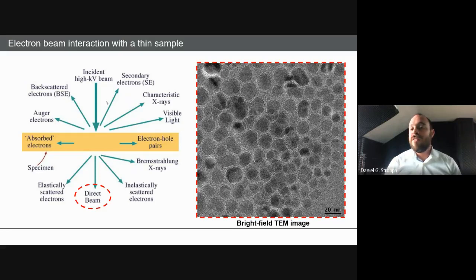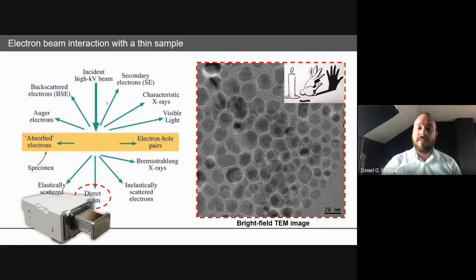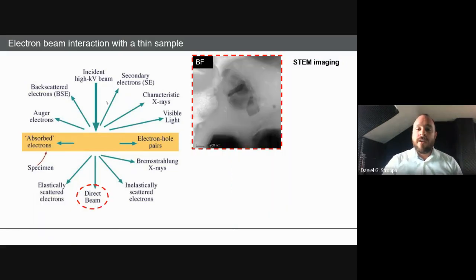And we can also collect different scattering ranges. And this is the core of STEM microscopy, that by collecting different annular ranges for the scattering, you're going to have different contrasts. So for instance here, if you collect what's called the dark field, that's an intermediary scattering range where diffraction effects dominate, we're going to see shining bright in the sample the regions that are heavily diffracting.